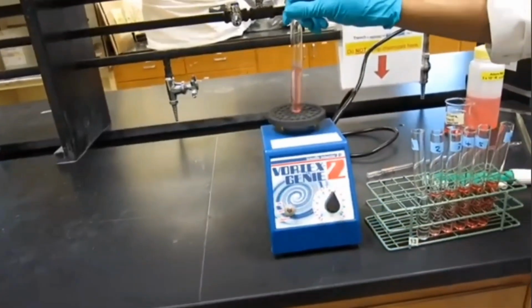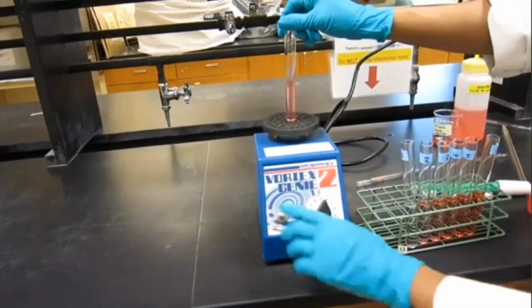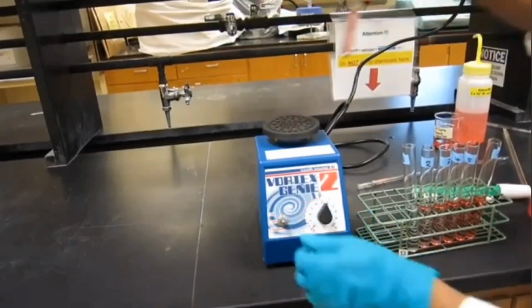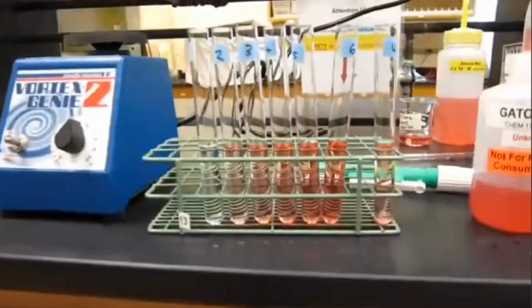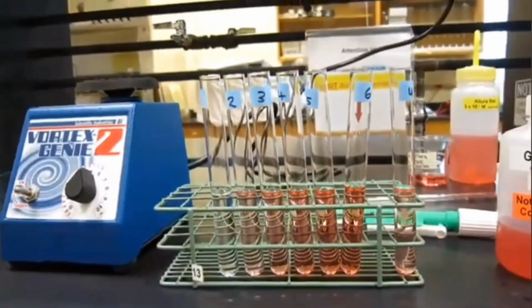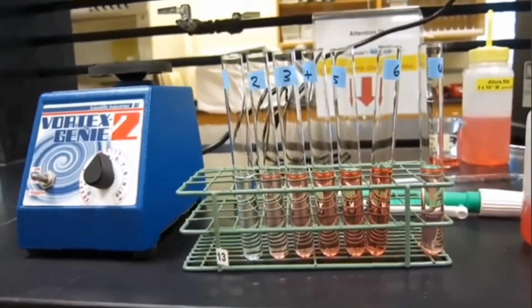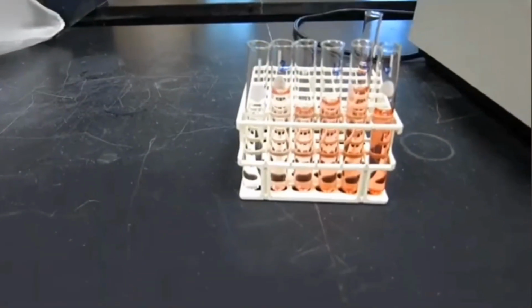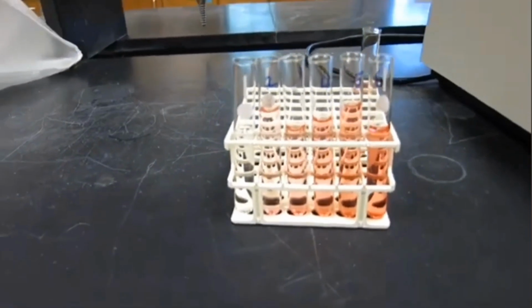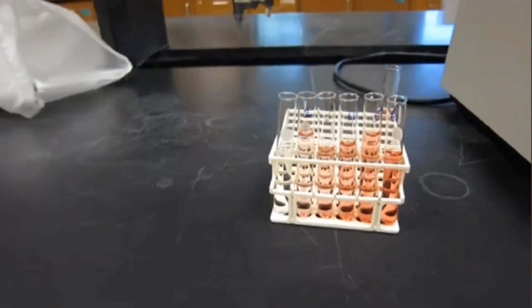So you can see we made our solutions for the calibration curve, which is from 0 to 10 milliliters of Allura red. 6 solutions for the calibration curve, and then the last one is going to be our unknown, which is from the Gatorade, that we're going to find out the amount of Allura red in the Gatorade sample.